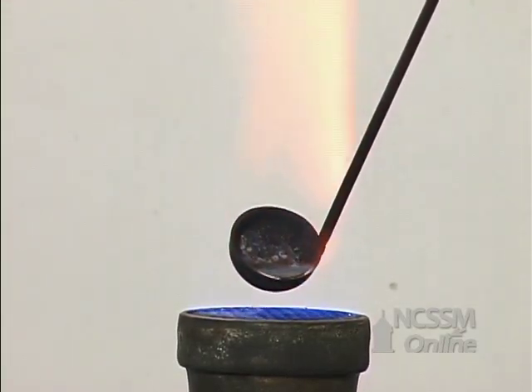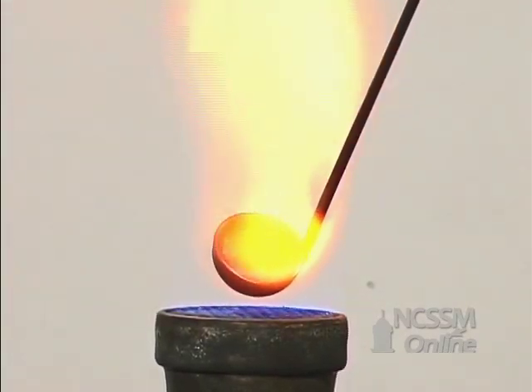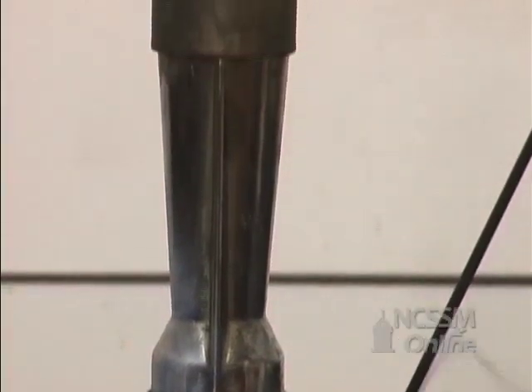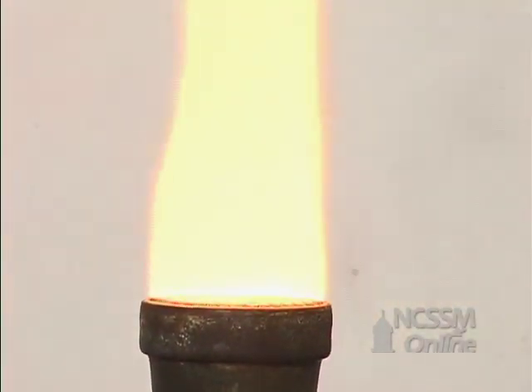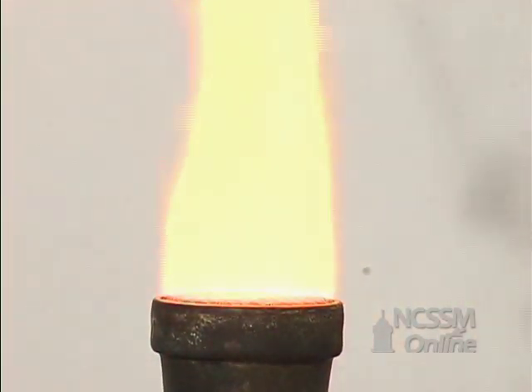The sodium starts to react with the oxygen in the air and burns. If we let a little bit of the smoke be drawn into the burner, we see the brilliant yellow color of the sodium flame test. The white smoke that we see is actually sodium peroxide being formed.